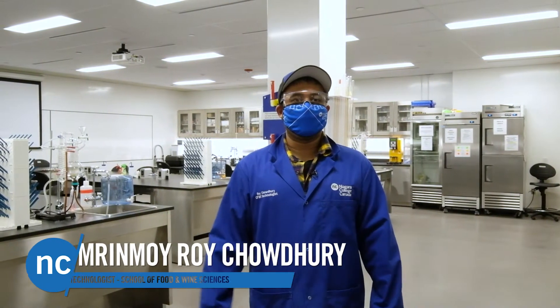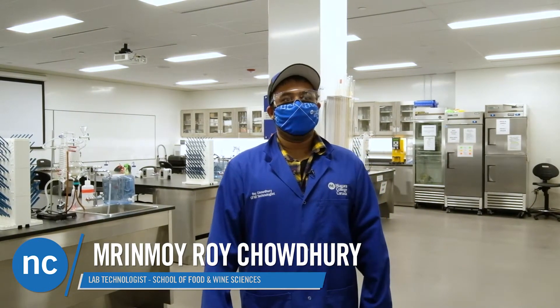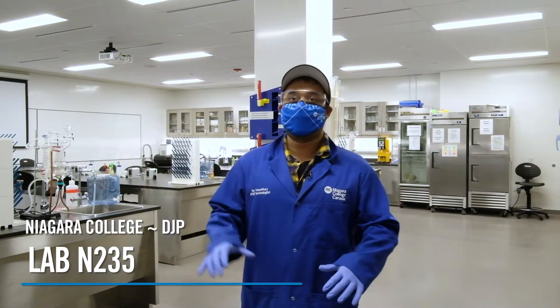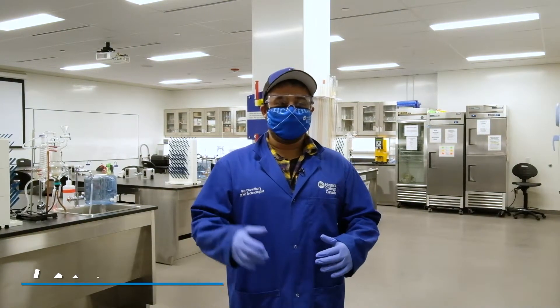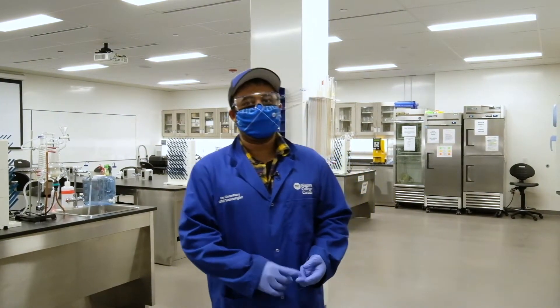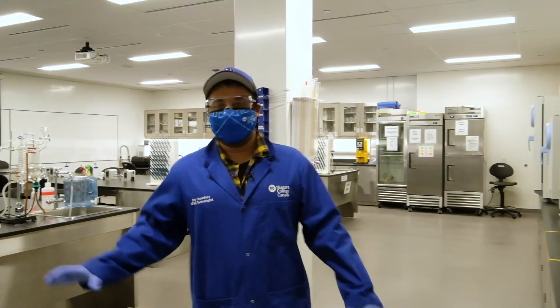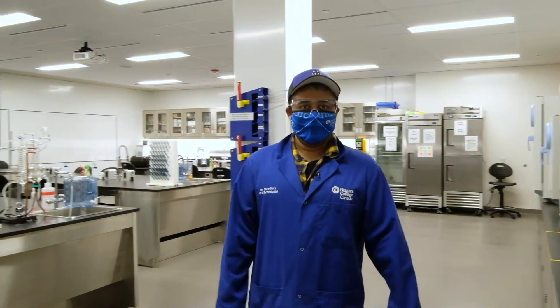Hi everyone, my name is Roy. I'm the CIAA lab technologist. Currently we're in lab N235. All the lab activities conducted here are by distillery students, wine students, brewery students, and food science students. There are a lot of equipment in this lab which I'll give you an overview of. Let's get started.